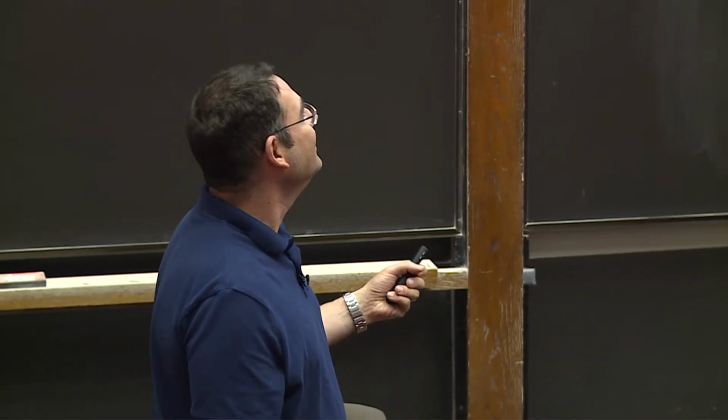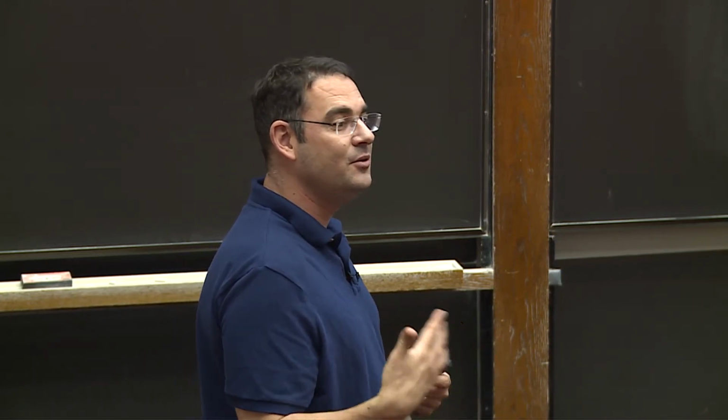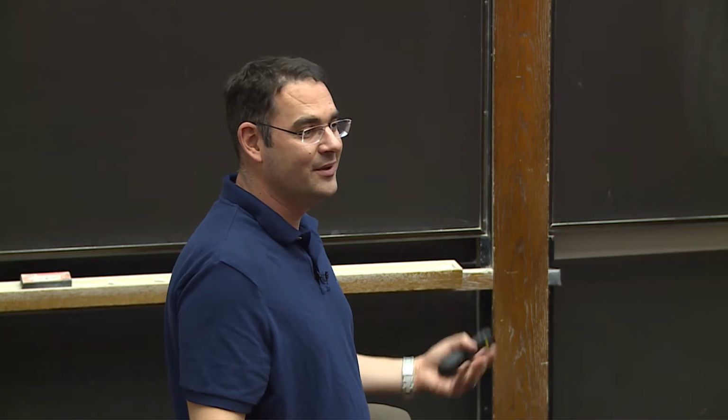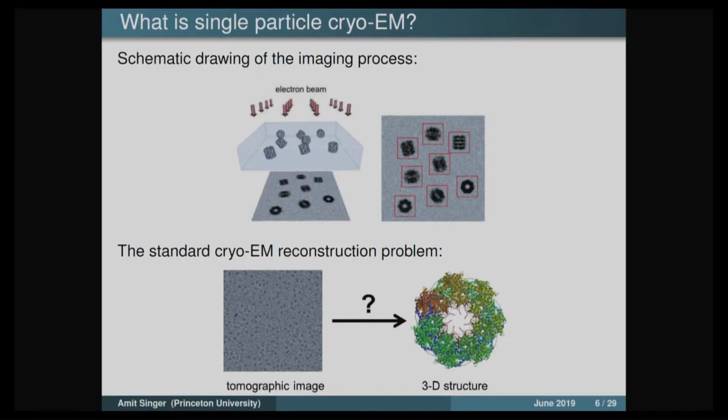Okay, so yeah, because otherwise, like Leo says, the contribution of the signal due to the water would be overwhelming the signals you really care about. So the reconstruction problem is somehow to figure out a way to go from the 2D projection images that are noisy, not so noisy here, but I'll show you more noisy images in a second, and with unknown orientation associated with them, and from this to predict the 3D structure. So very different information from what you get from NMR.